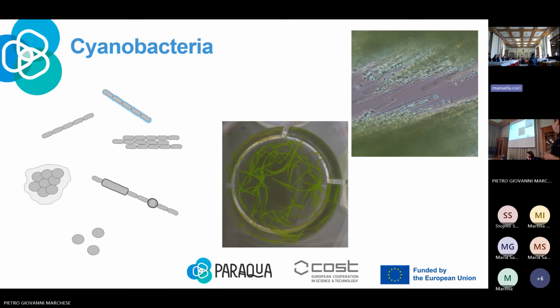several reasons. We can find very large fascicles of, for example, Aphanizomenon flos-aquae filaments. They can reach a size of even 2 or 3 centimeters in nature. But after, let's say, 2 or 3 years of cultivation in the lab, this unique feature of Aphanizomenon can disappear. Why?